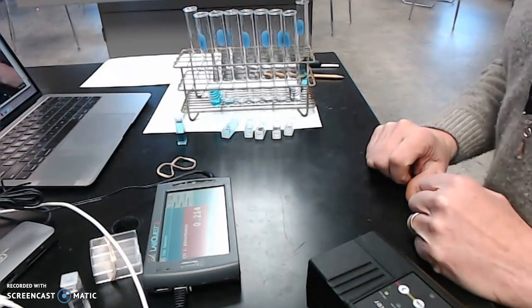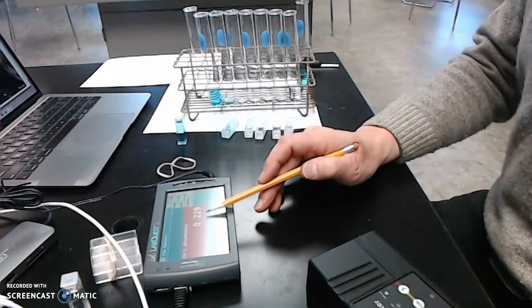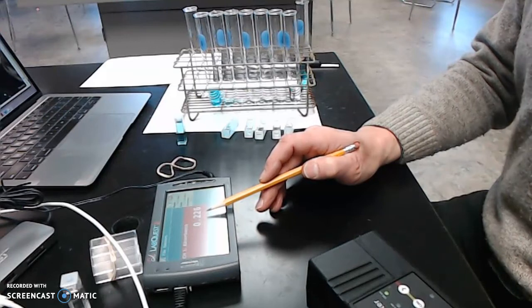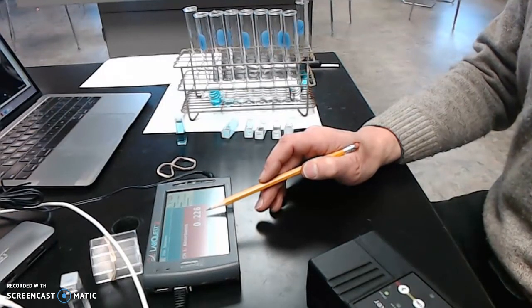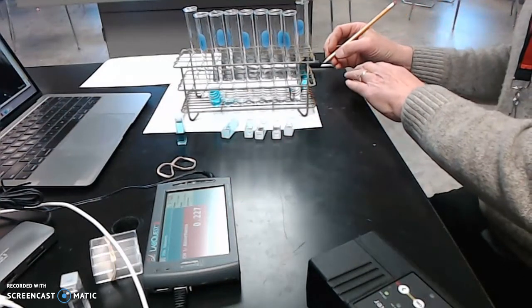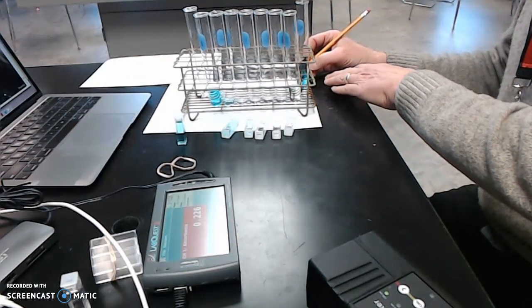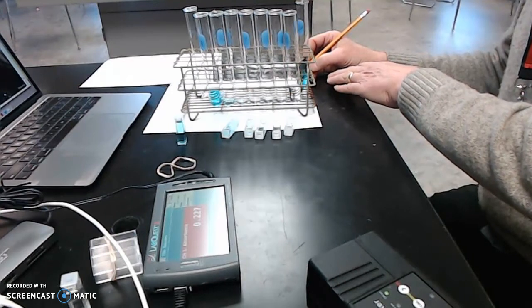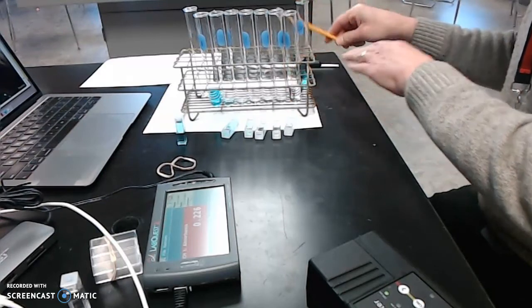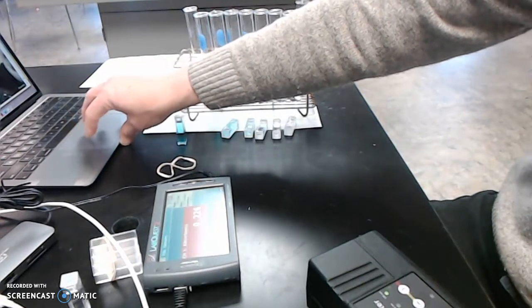Hey, our second one, if you're looking at the data on the LabQuest, we've got the numbers right here. Look at that, it's stable. 0.226, 0.227, 0.228, so let's go with 0.227. And I will pause and come back and give you more data.